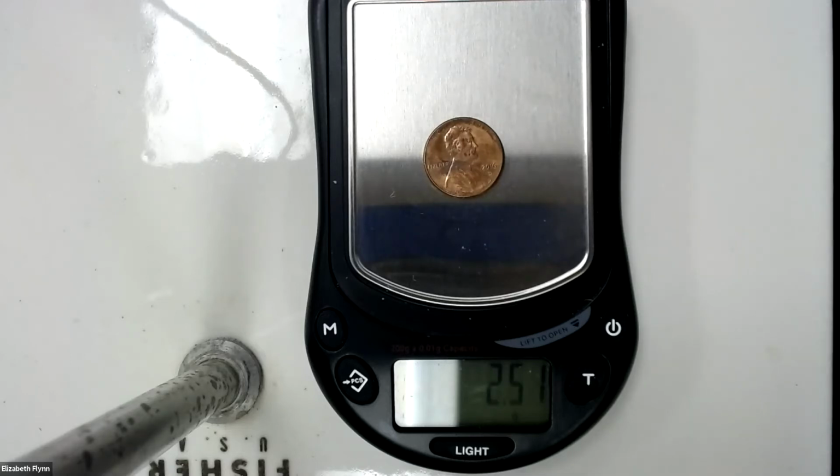So that's what I write down. If there was a 2.50 there, what would we write down? Exactly, we would write down 2.50. Every digit in a digital readout is a significant digit, and so we write down all the digits.